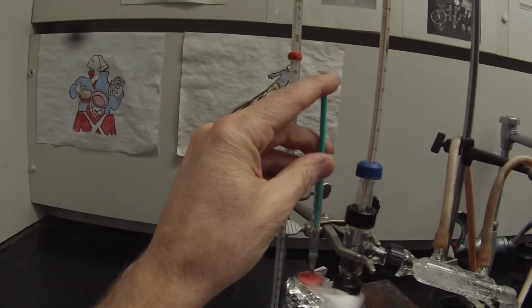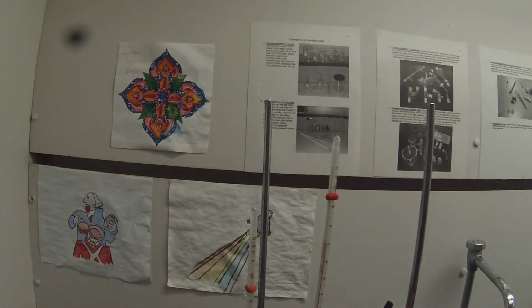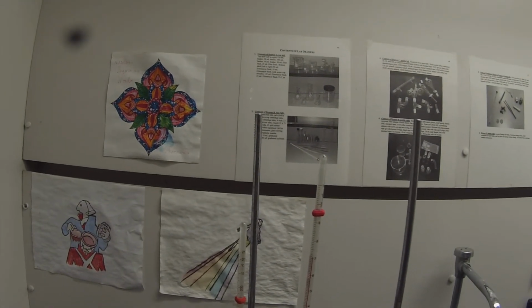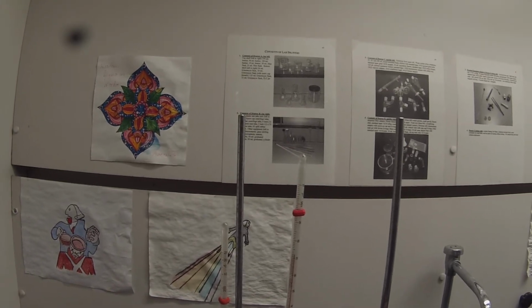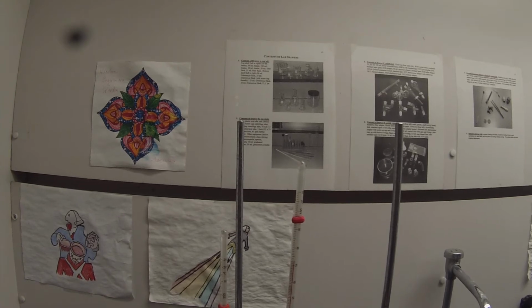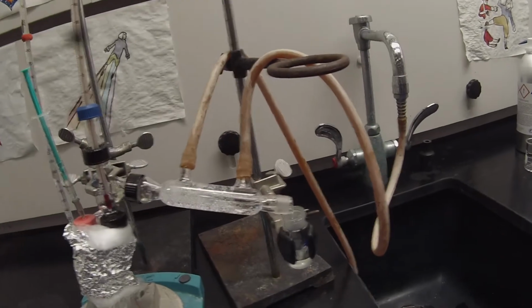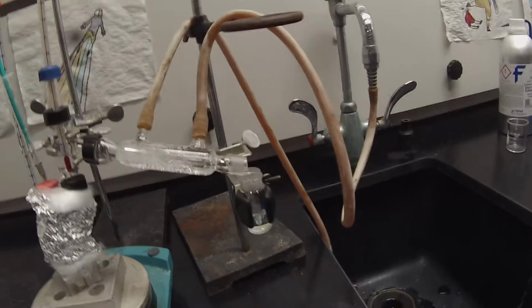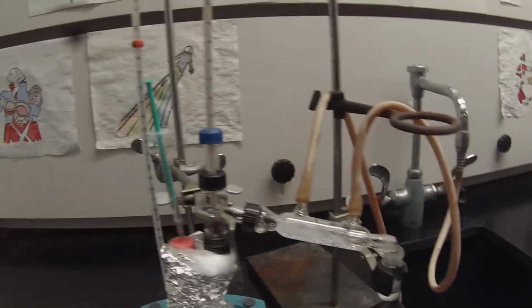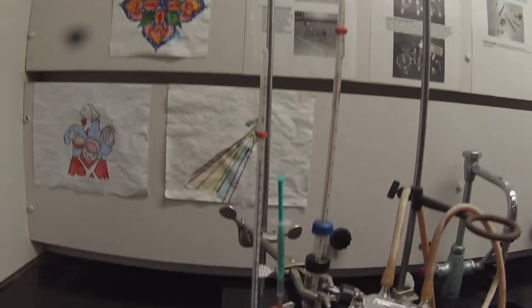We'll add another milliliter. See if that shoots that temperature up above 70 again. Yep. Coming up to about 73 when I add the extra. And there's definitely a drip ready. Yeah, another mil.